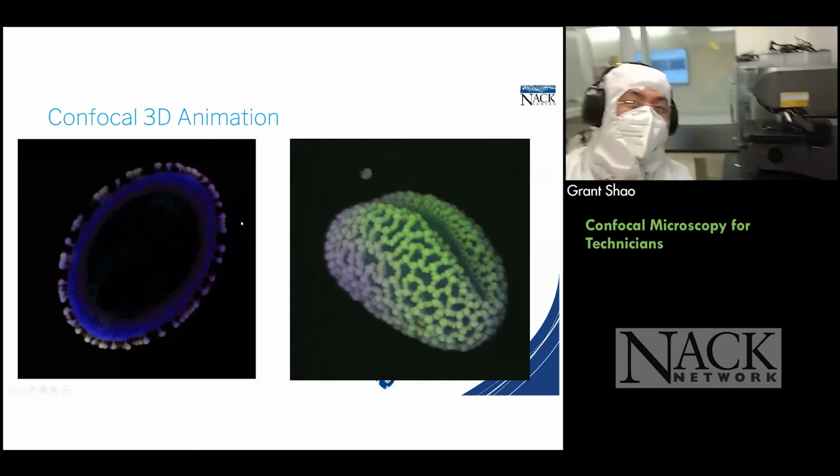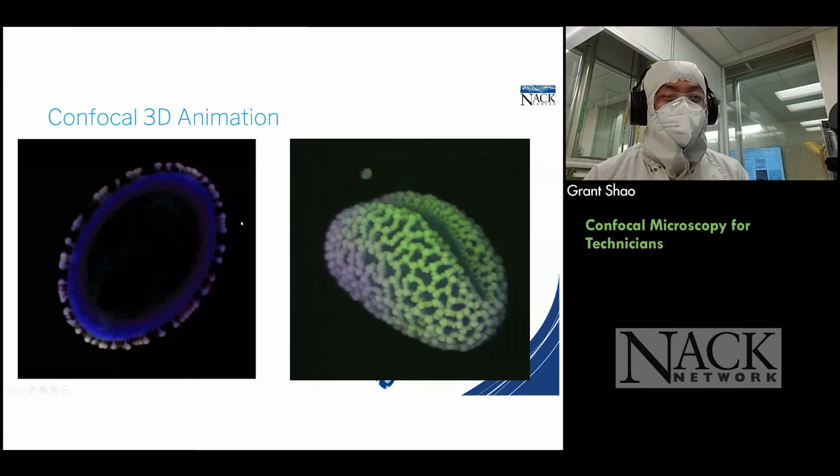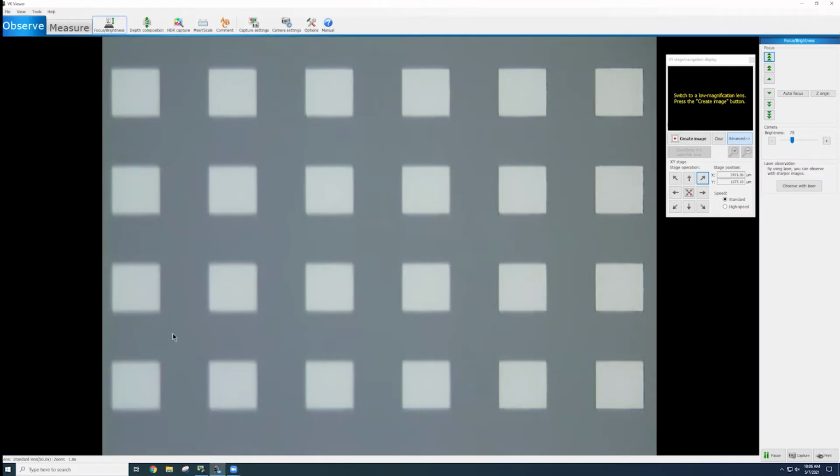So here I have that guy. It's a Keyence VK-X 3D laser scanning confocal microscope. I don't really dive into the manual stuff that Peter talked about. It just automates things for me, and I just teach our users how to use it. Basically, we have the stage. We could do manual focus in that way, and then you could do further fine tuning with the lens itself.